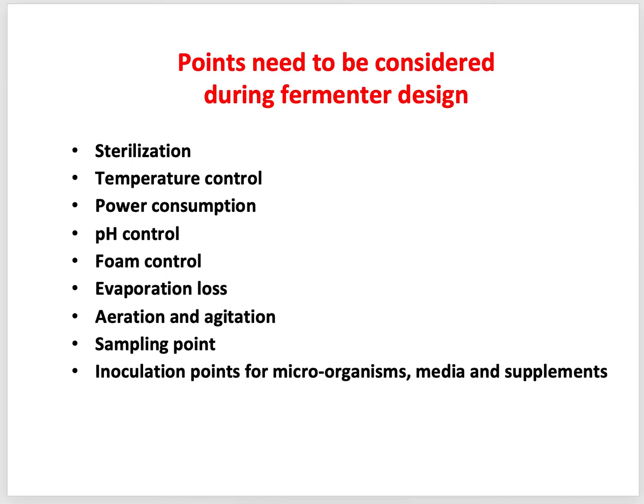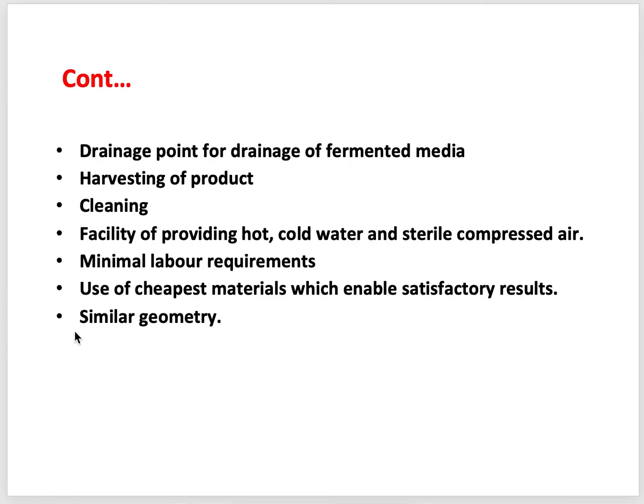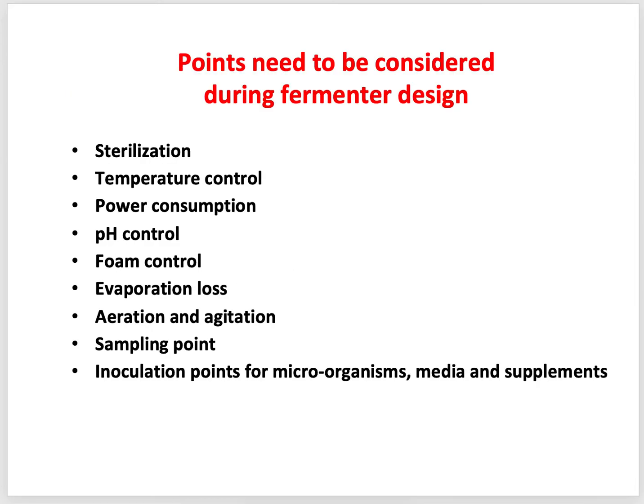I mean, we don't have to give the biocatalyst any time to get adapted to the new environment. Okay, that's why it's important that the geometry of the final big fermenter and the pilot fermenters will be similar. Okay, so these were the points that we should keep in mind when we want to design a fermenter.